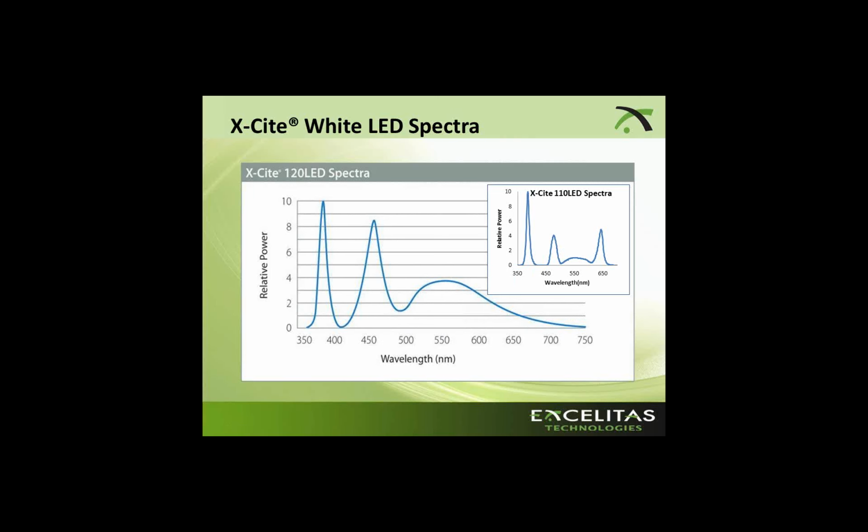And the reason for that is because there's no demand for those kinds of wavelengths in the lighting industry or in your LED TVs at home. Therefore, the prices are very, very high, and the lifetimes are very low. So if somebody contacts me and says, can you make a 340 LED? Absolutely. If you talk to our R&D people, they'll get it made, but the lifetime will be short and the price will be a lot. And we don't like to do that to our customers.